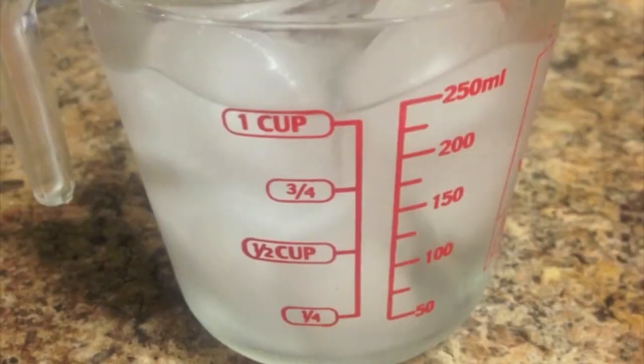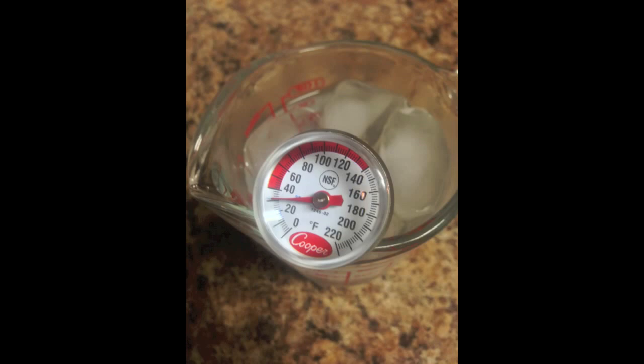Now we're going to wait two minutes to read it. Right now it's on 40 degrees. The two minutes are up and here are the end results: 32 degrees Fahrenheit, 33 degrees Fahrenheit.